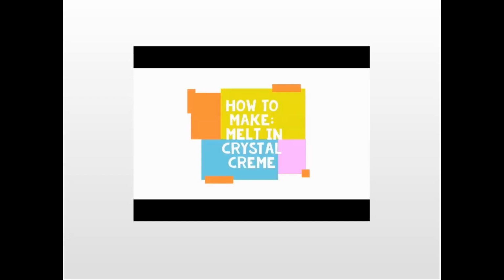So that was the video. You can see that I used the lab reactor, which was easy to assemble and simplifies the standard batch manufacturing process. So I'm just going to show you the setup again.